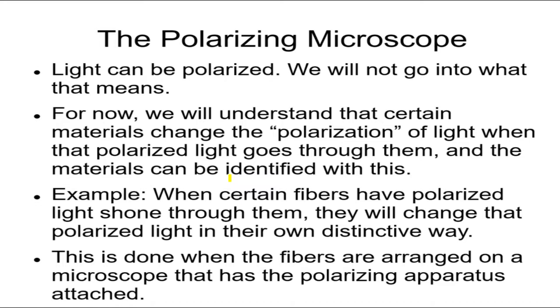Then you can be pretty certain that these fibers are from the same, let's say, batch, from the same carpet. So you can connect two things in that way. Now, they're carpet fibers. You can't just put the whole thing in a beaker. You have to use a microscope because they're really tiny.